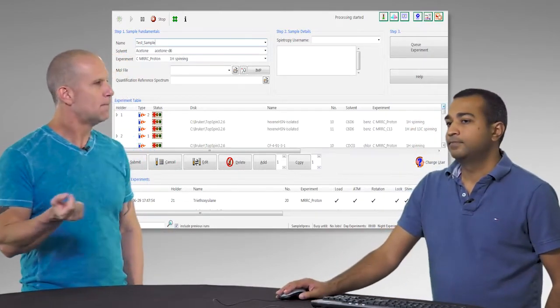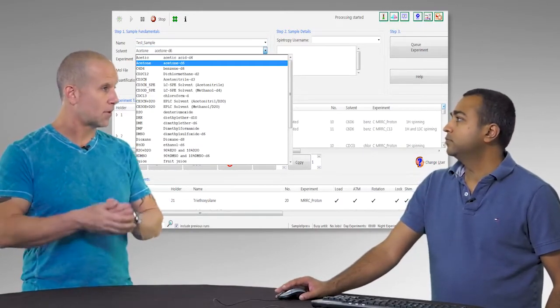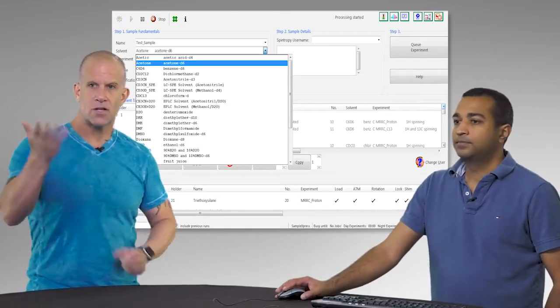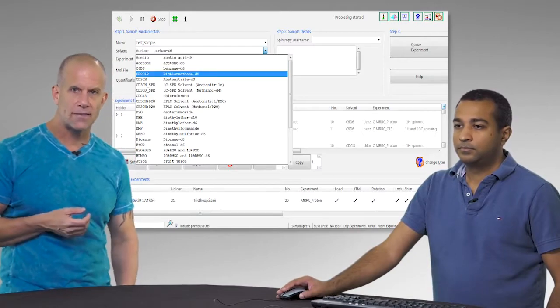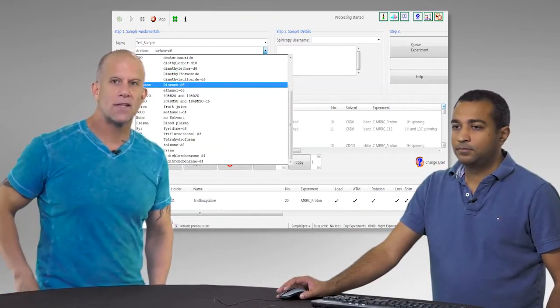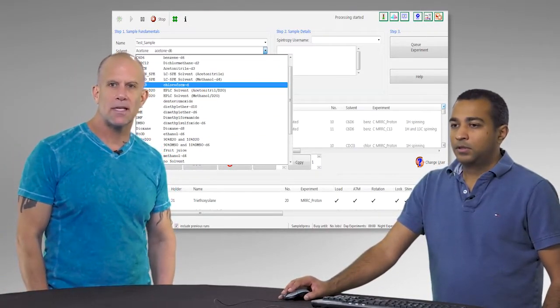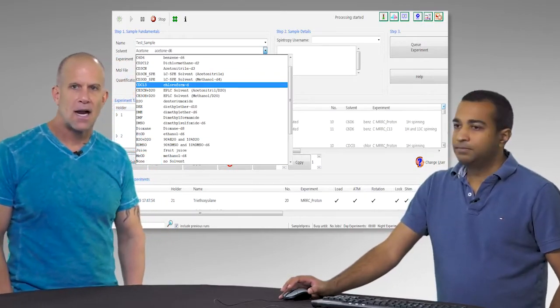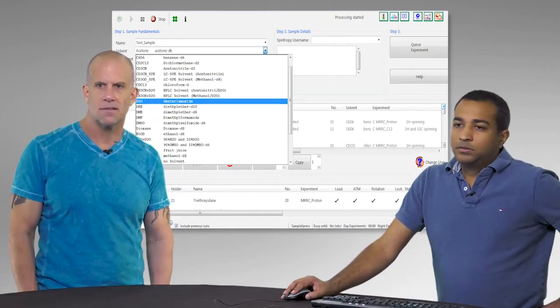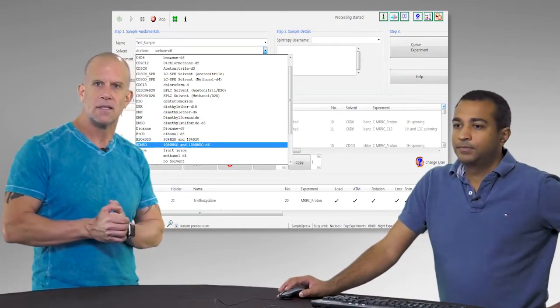So in NMR, it's a requirement that you run whatever sample for liquid state NMR dissolved in a deuterated solvent. And so you have quite a large choice here. Basically your sample has to be in one of these deuterated solvents. The most common is probably deuterated chloroform, but most are represented: acetonitrile, methanols, ethanol, so most alcohols, some hydrocarbons, et cetera.